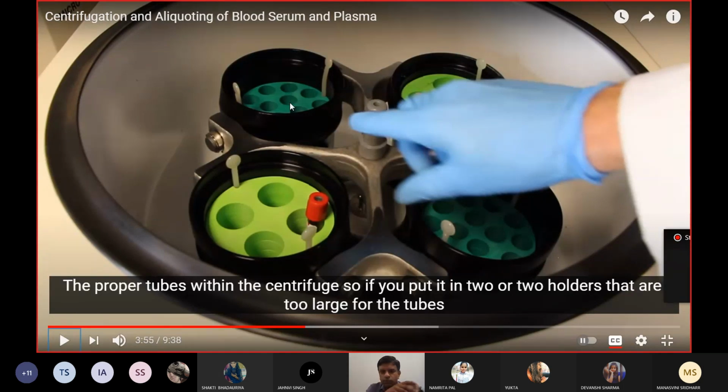Okay, so we usually don't go for the exact weight. The machines are capable of balancing a bit of up and down, right? But the weight of both the sides should almost be equal.